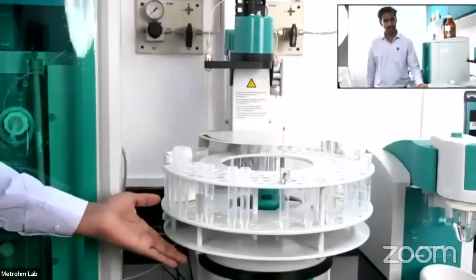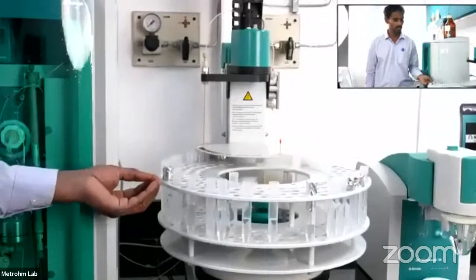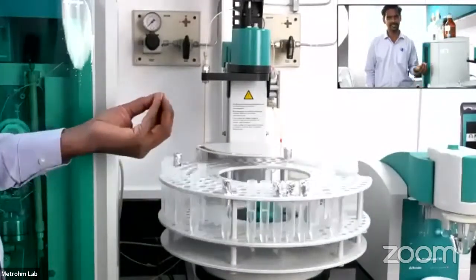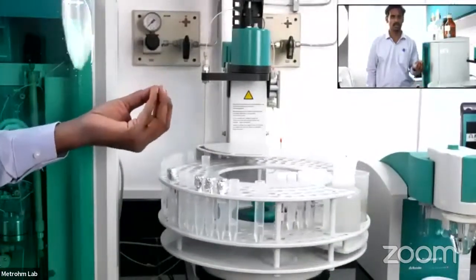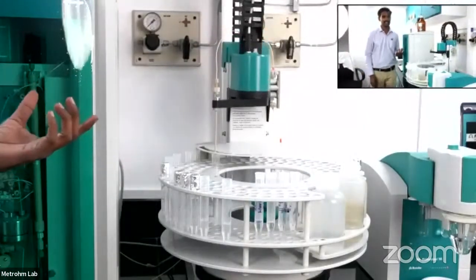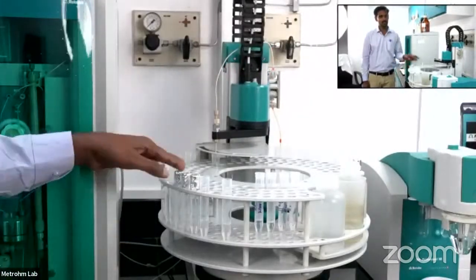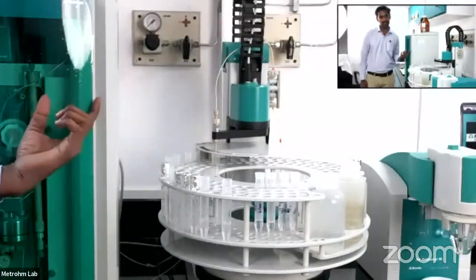So this is our 858 IC autosampler. We can keep 10 ml of sample in the autosampler. Each analysis requires only 1 ml or 1.5 ml, which is sufficient for these anion or cation applications. Right now it is going for the injections. Now it is taking the sample to the system.